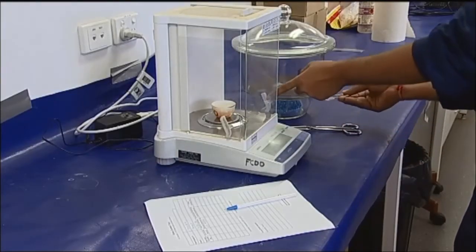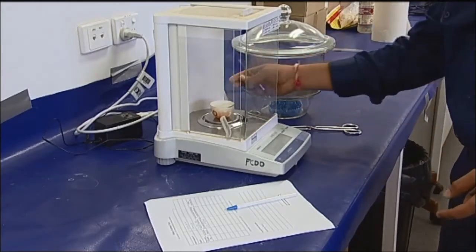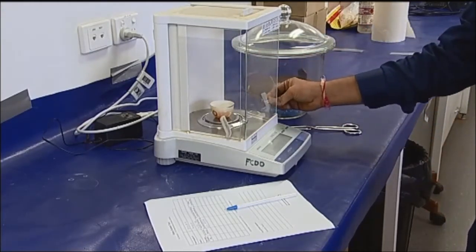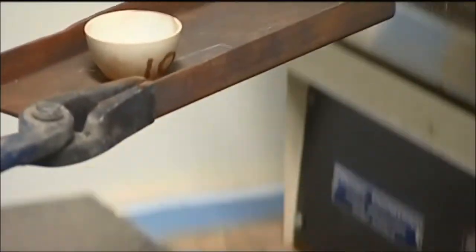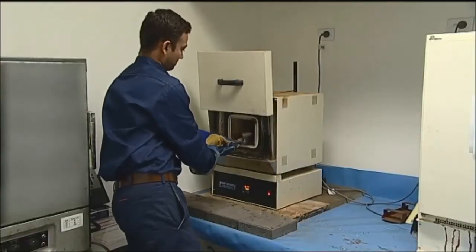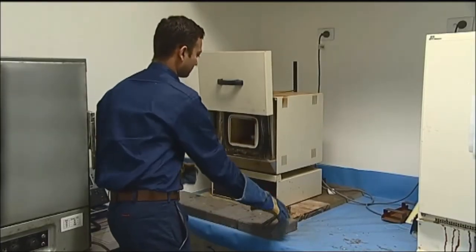Knowledge of the volume fractions of fibre and matrix materials is essential for quality control during manufacturing of composites. The pre-weighed sample is placed on a dried pre-weighed porcelain crucible and is allowed to burn away in an oven at 500 degrees Celsius for two hours.